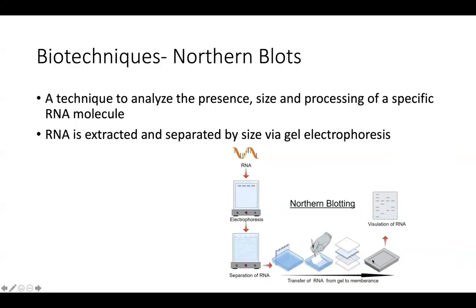So another biotechnique that's becoming increasingly common in labs is called a northern blot. Jot that down. This northern blot technique is a technique to analyze RNA. We want to analyze the presence, size, and specifics of an RNA molecule, right? And so basically we have to do the RNA extraction process.